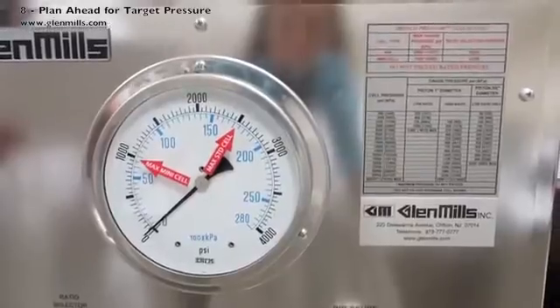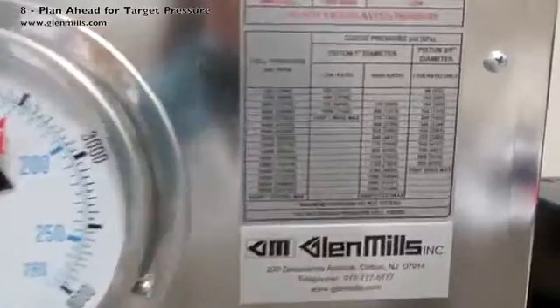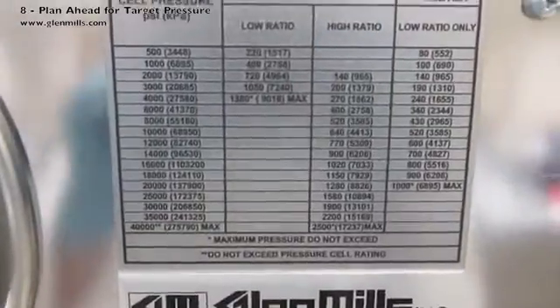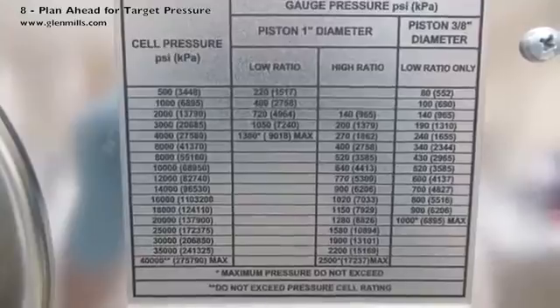Knowing the pressure needed to break the cells, look on the conversion table under the column labeled '1 inch standard pressure cell.' Then look to the gauge pressure to determine what the gauge needle needs to reach during the run.